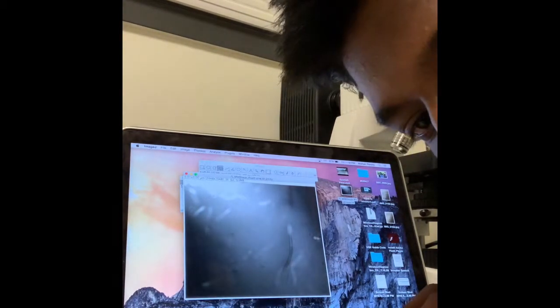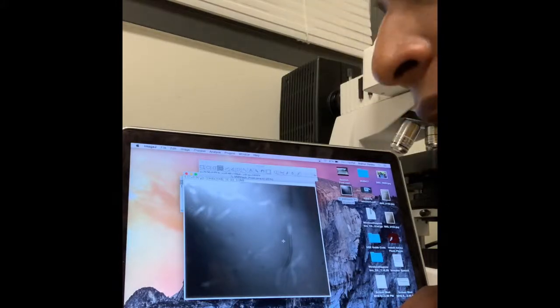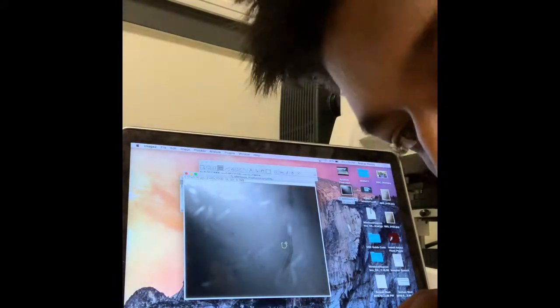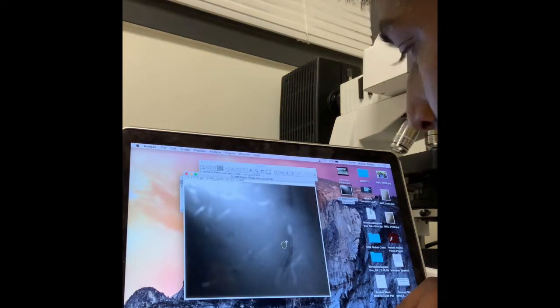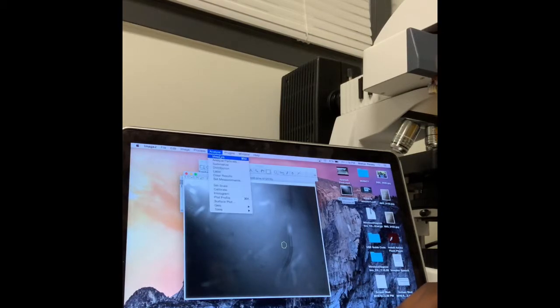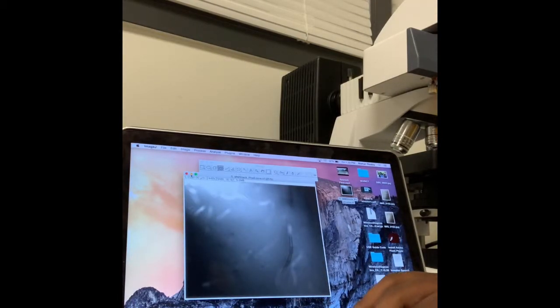Once you trace your worms, make sure you trace around 3 background examples. Just little circles where there are no other worms and it's complete background, and measure those too. So go to Measure. It's pretty easy, so you just do this for everything. Just Command M, and make sure you keep your data organized, because you don't want to forget whether this is the worm or the background. Just keep that under control. And so I'll show you how to do the Google Sheet.